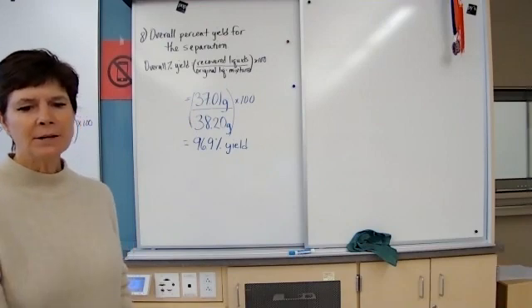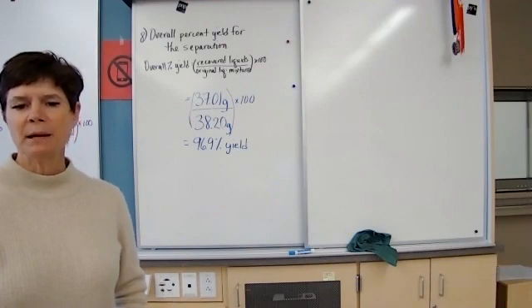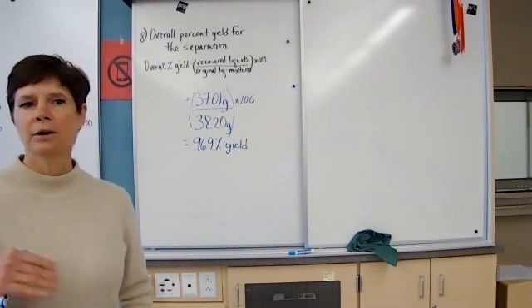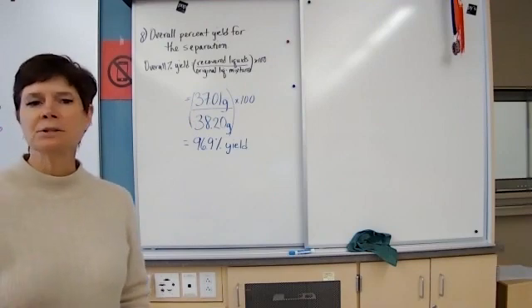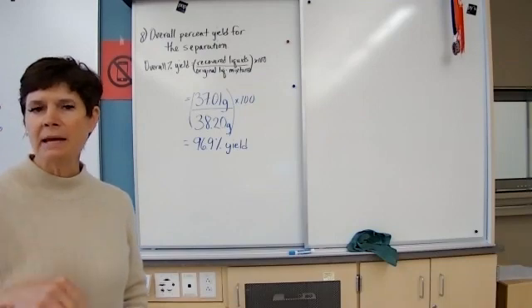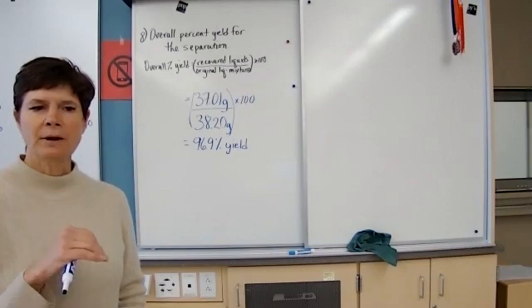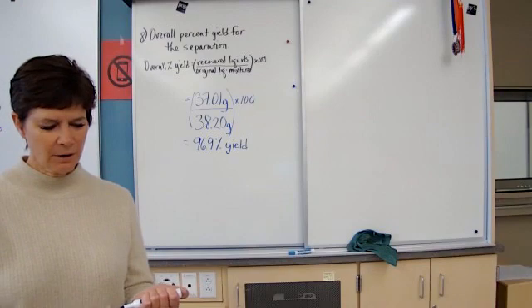The last piece that you're being asked about for this pre-lab is, how would you anticipate the separation of a mixture of salt, sand, and iron would be different from the separation of the oil and vinegar that I described in this pre-lab? So I'm not going to give you the answers to this question. This is a thinking question. You're supposed to think through how making a mixture of sand, salt, and iron would be different when you have the challenge of separating that mixture than the mixture of oil and vinegar.